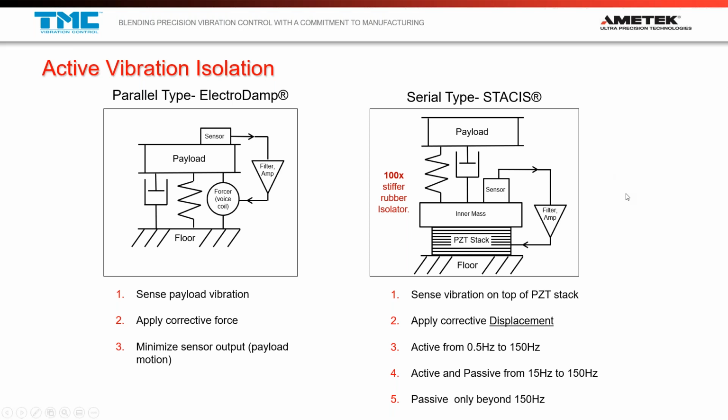But in the serial type system, you have all stiff components. We're not using low frequency passive isolators here. The inner mass here has a very, very high frequency in the thousands of hertz. And piezoelectric stacks are also very high resonant frequency systems. Furthermore, we're isolated from payload noise. So the payload might be doing all sorts of things on top, but we've got this spring here, which has a reverse effect. Its purpose is not 100% floor vibration cancellation, but it's also providing isolation from payload noise to the sensor.